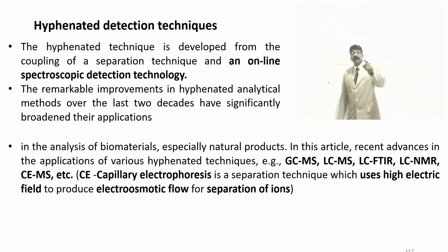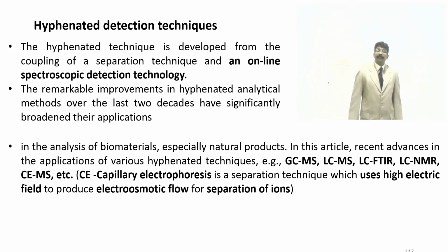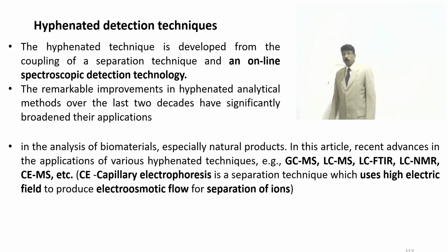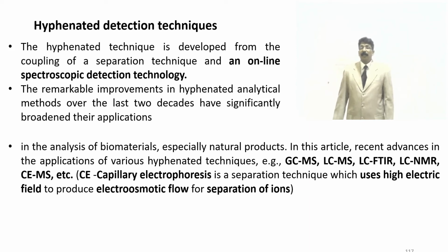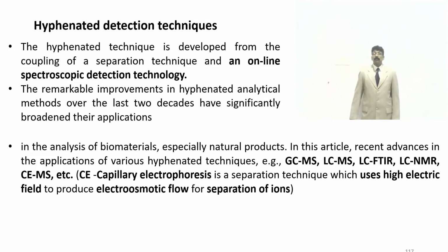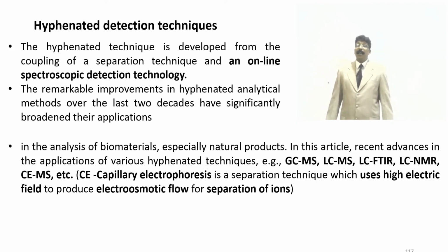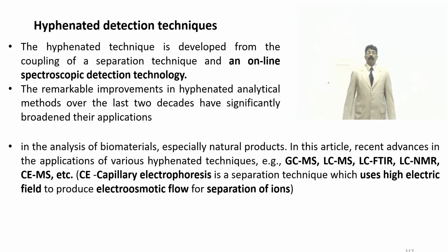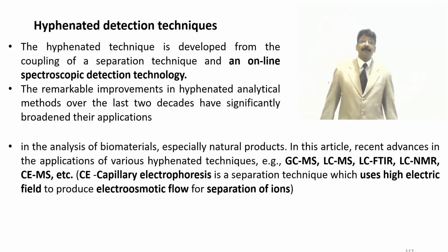In this article, I have taken, they have mentioned recent advances in the application of various hyphenated techniques like gas chromatography connected with mass spectroscopy, liquid chromatography connected with mass spectroscopy, LC-MS, GC-MS, LC-FTIR, liquid chromatography connected with Fourier transform infrared spectroscopy, liquid chromatography connected with NMR, nuclear magnetic resonance, and CE connected with MS. Capillary electrophoresis is connected with mass spectroscopy.